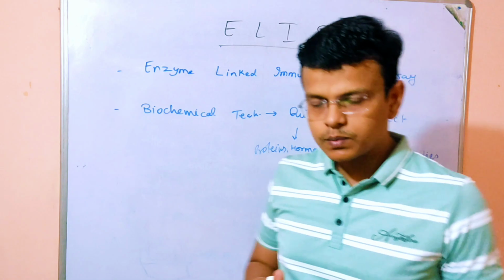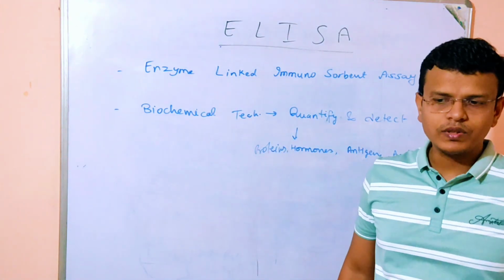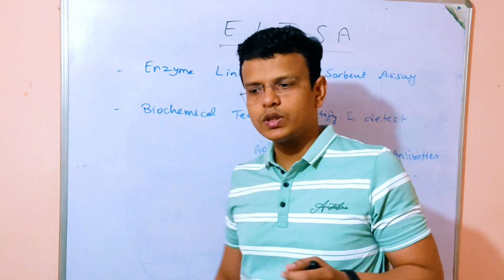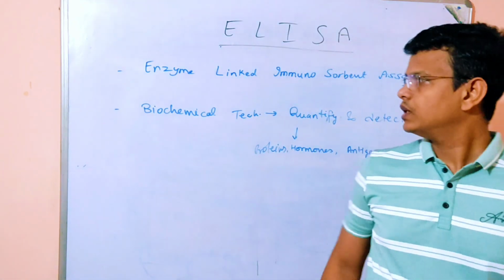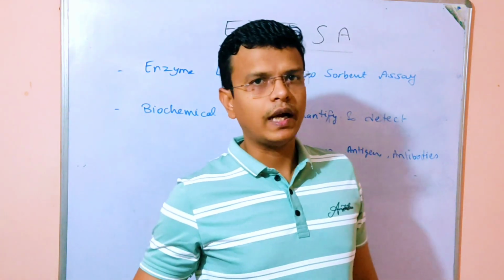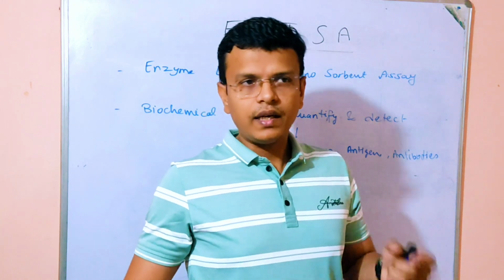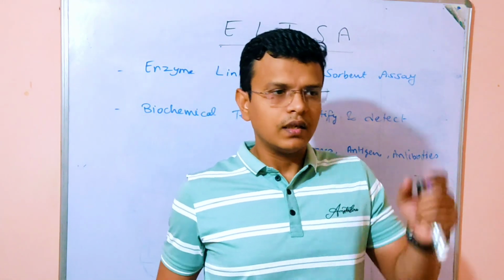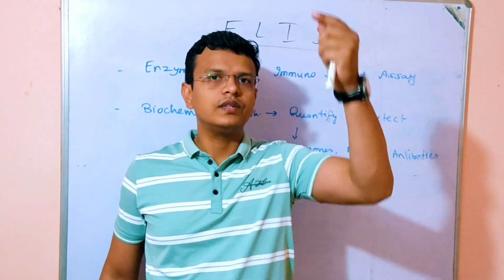Okay. It is based on antigen-antibody interaction with an enzyme-linked reaction producing a measurable signal. It means here antigen and antibody bind to each other and produce a signal, and this machine, the ELISA reader, finds and calculates those signals and converts them into digital values.